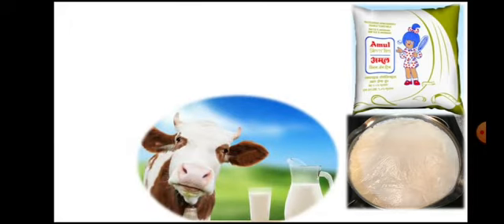Then we need to have another control. Now in both these milk samples there will be absence of phosphatase. Now we want one control in which phosphatase enzyme is present. So what is that? It is raw milk. So raw milk will be useful for the preparation of positive control in which phosphatase enzyme is intact. This will be useful for preparation of negative control.